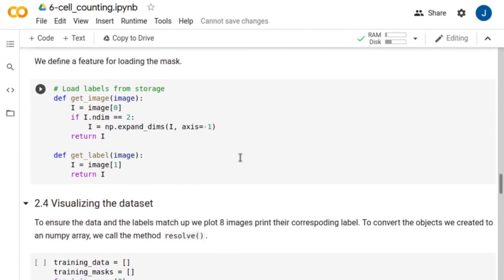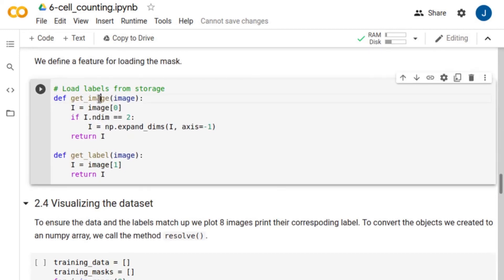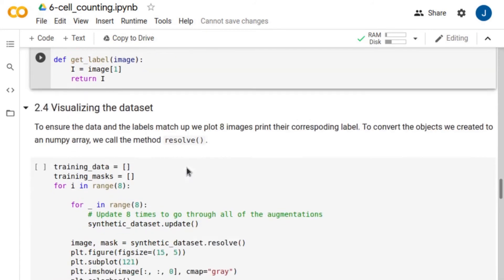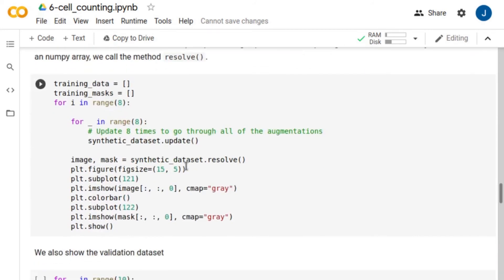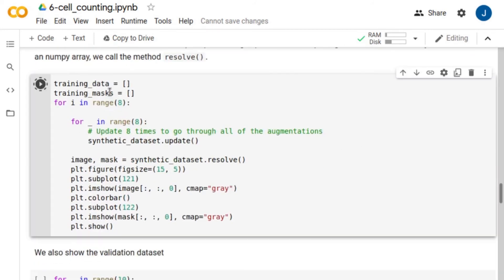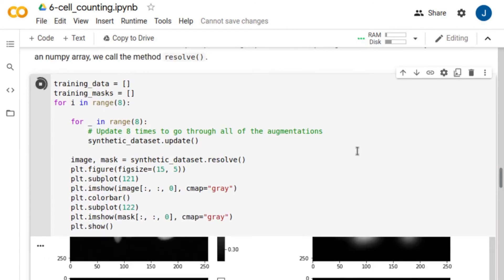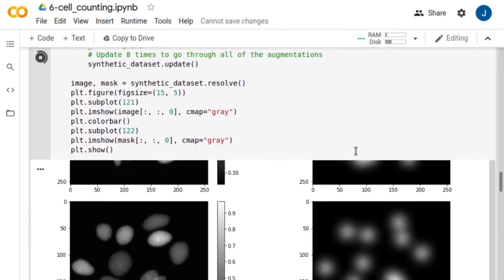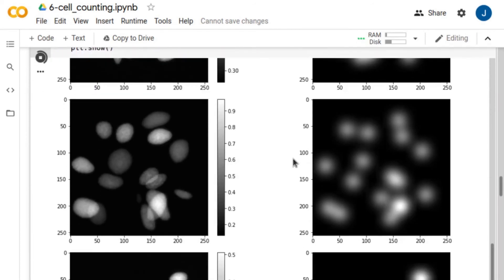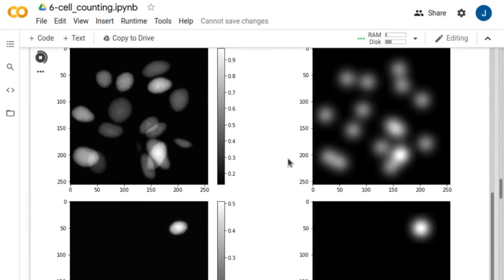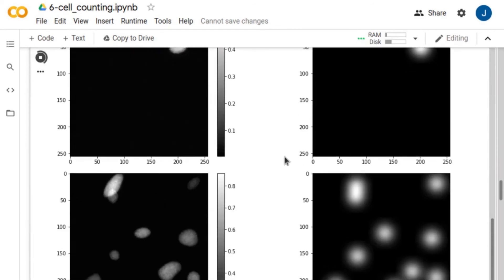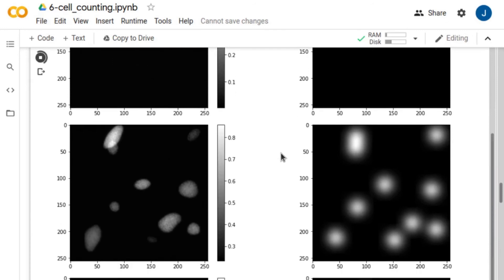Next, we define these two functions to retrieve the images and labels from the combined dataset. Let's visualize some image examples and their corresponding labels. For training, these are synthetic cell images.